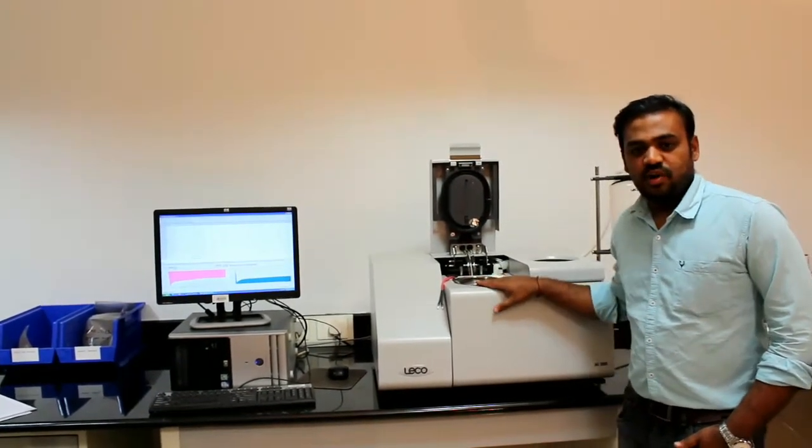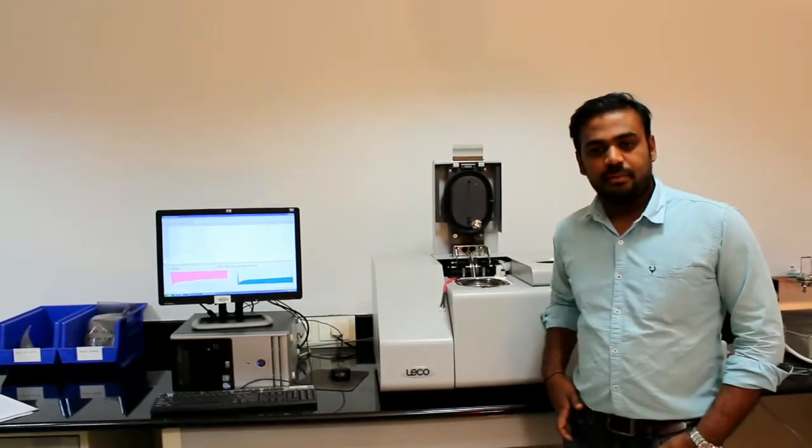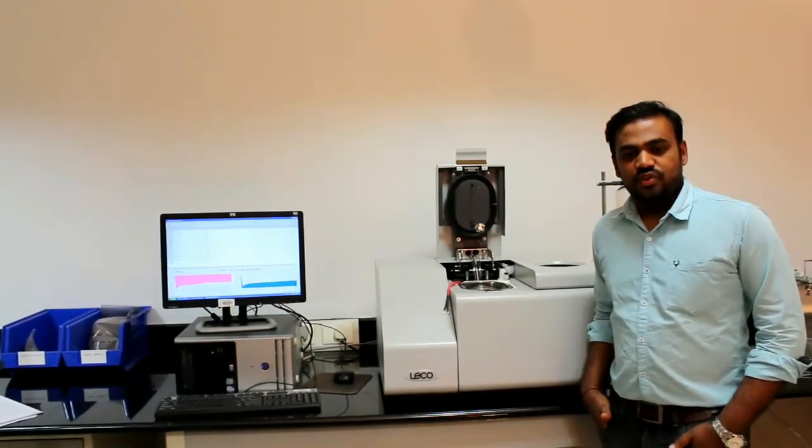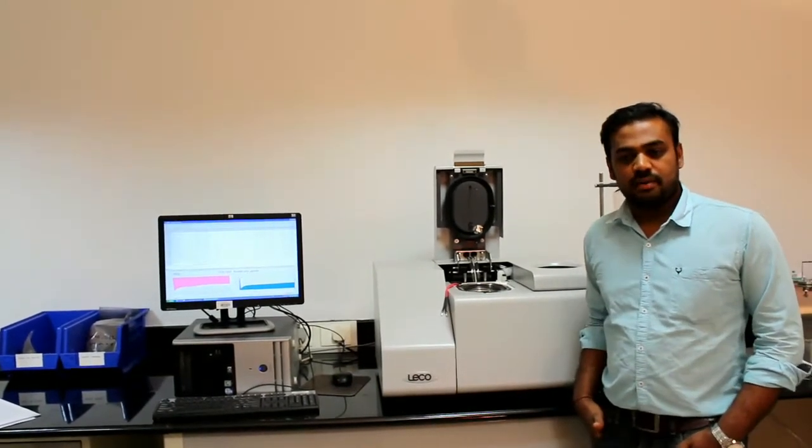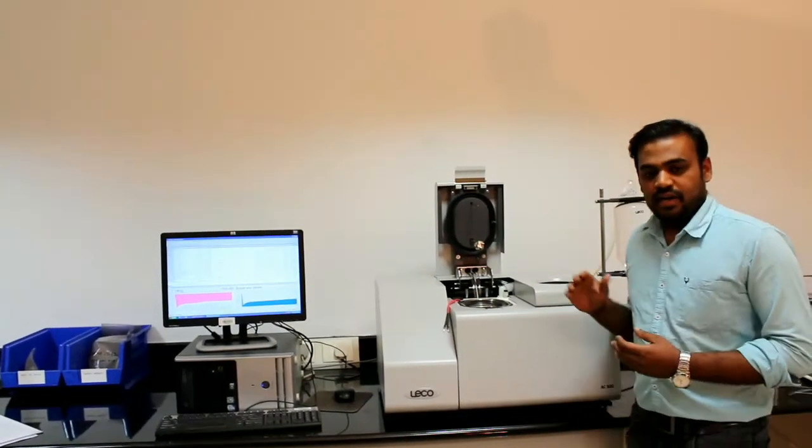This is an isoperimetric method which we can analyze the sample between 4.5 to 8 minutes, depending upon the mode which we have selected. The standard mode which we are preferring is high precision, which takes 8 minutes to analyze the sample. In that 8 minutes, 3 minutes for equilibrating and the remaining 5 minutes for sample burning time.